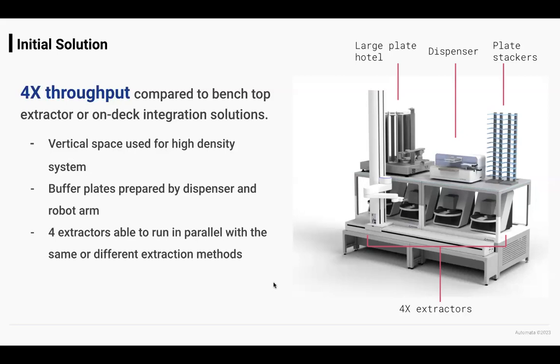Another thing I quite like about this as well is it offered a little bit of extra flexibility. So you could actually put different chemistries on here. They don't all need to be running the same thing. You could have one extracting from blood, one extracting from tissue or saliva or anything really that is capable with these extractors. So you could have the same patients, but 4 different tissue types or something like that, where it can all be combined at the end.